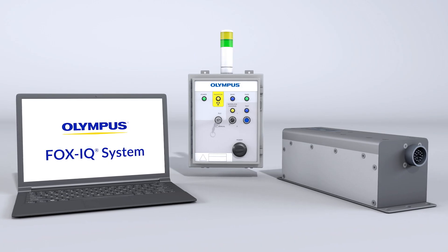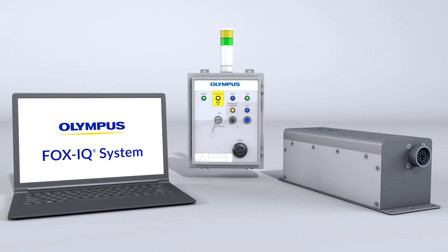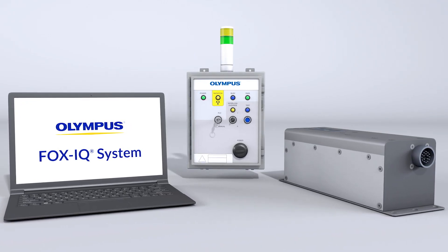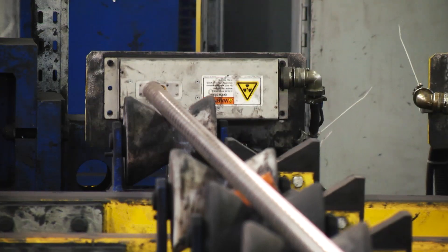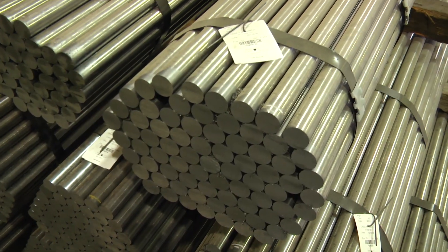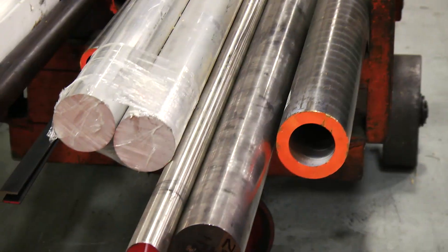The FOXIQ inline XRF analyzer performs fully automated analysis for high-volume process control. X-ray fluorescence, or XRF, is a proven technique used to quickly and non-destructively verify alloy grade and chemistry.